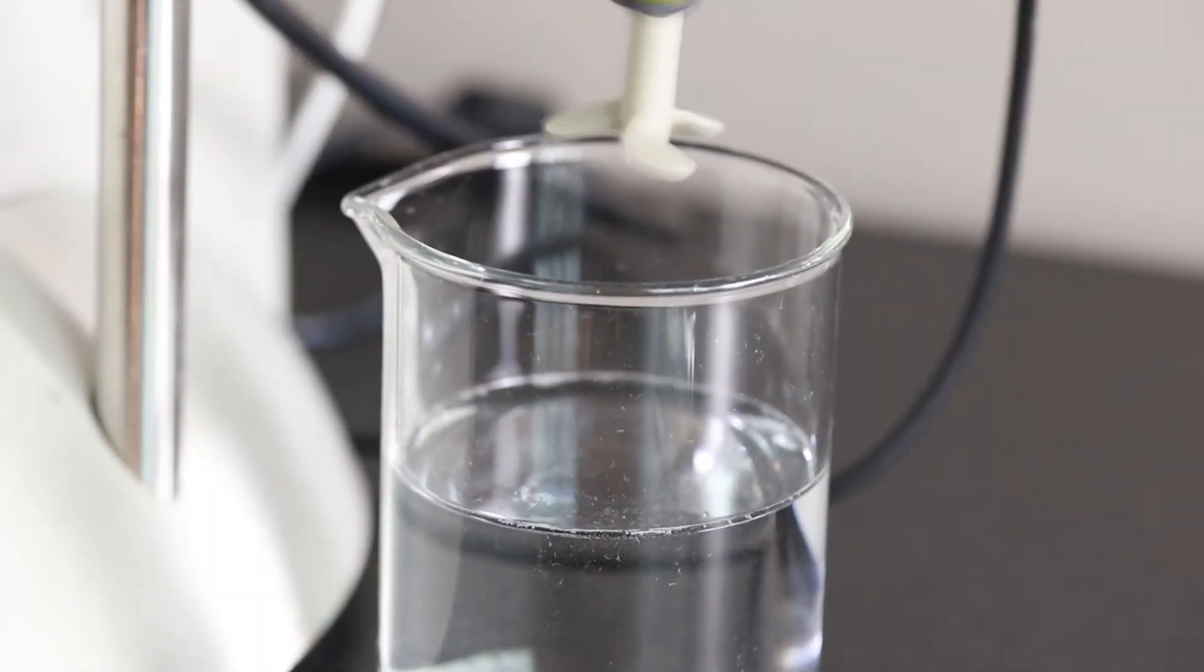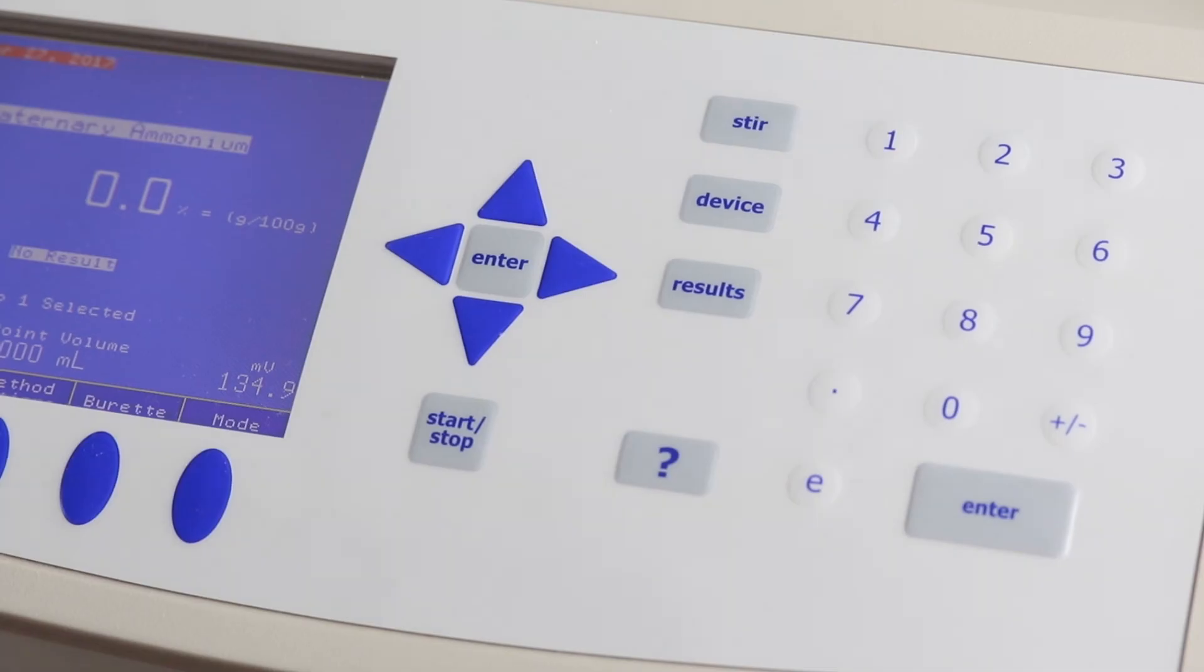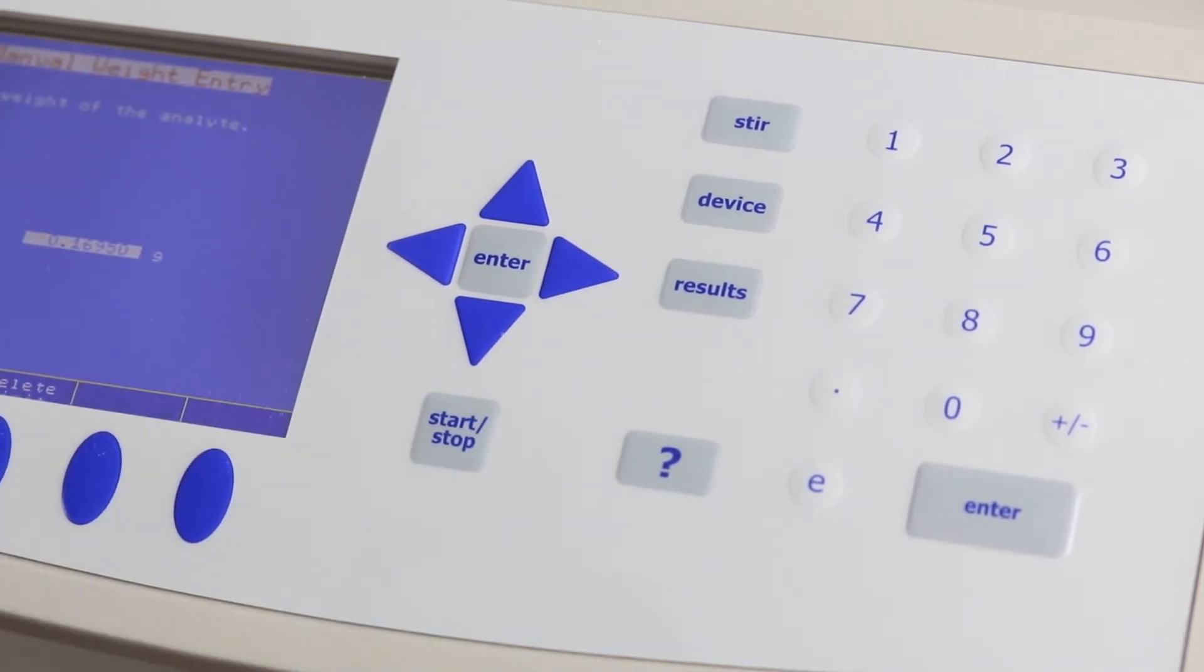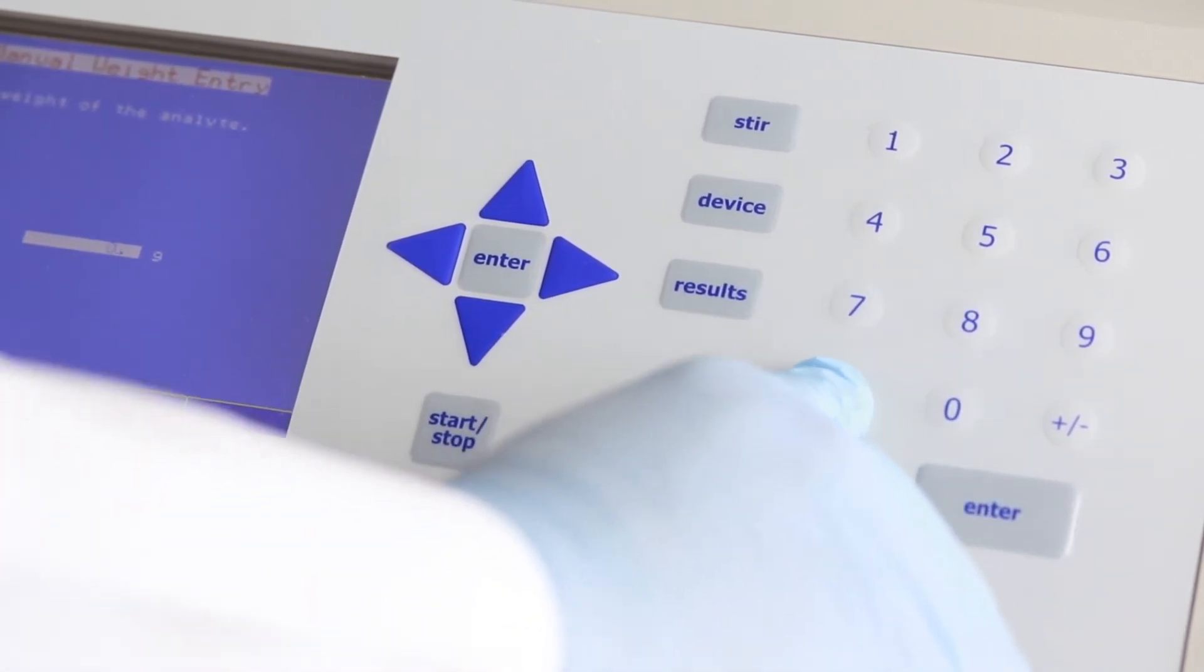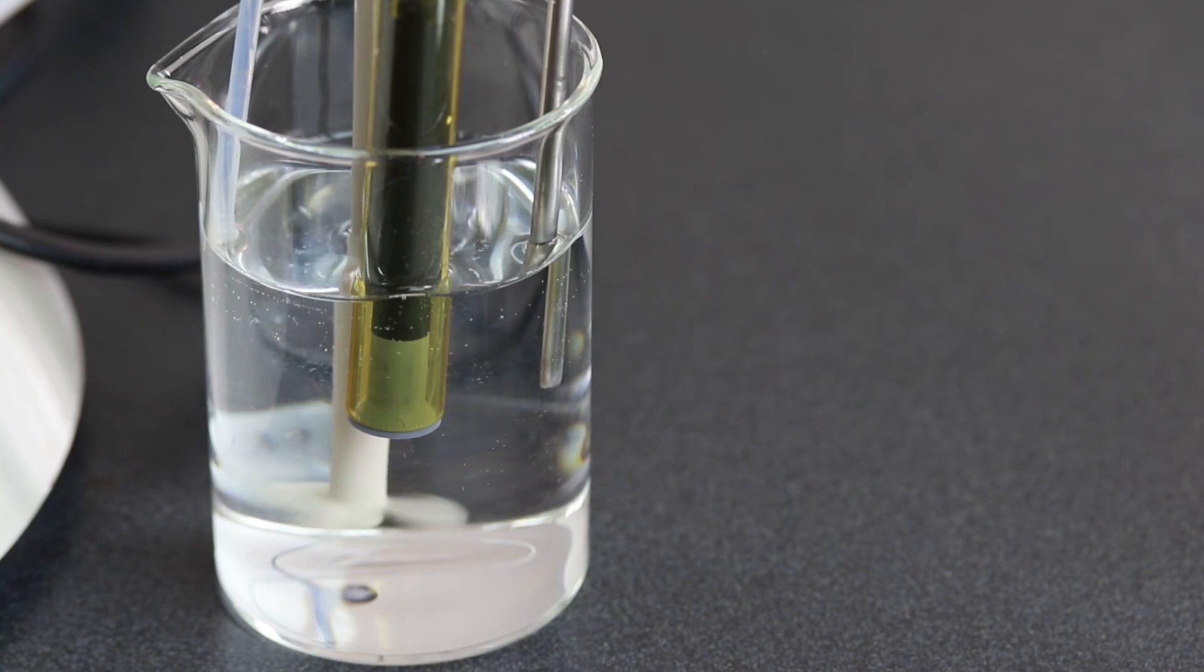Next, I'll submerge the electrode and stirrer into the sample beaker and press start. Again, I'll enter the weight of the surfactant sample and press enter. And now, we can walk away while the titrator does the rest.